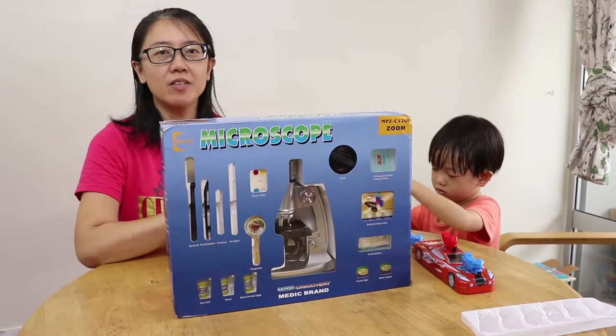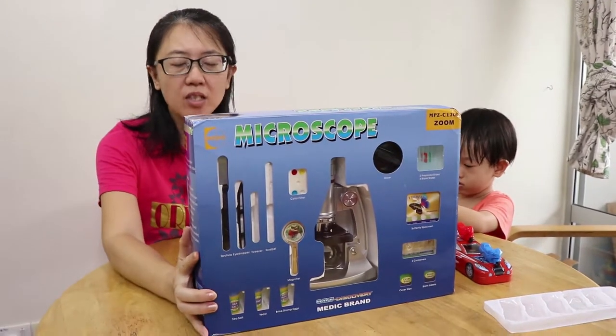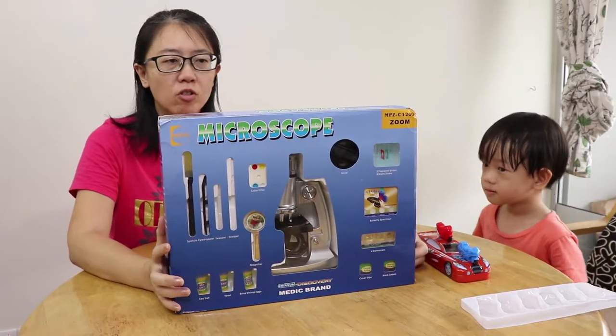Hello everyone, welcome back to Jaycee's World. Today we are going to unbox the OMT Discovery Microscope. It's going to be Jaycee's first microscope.